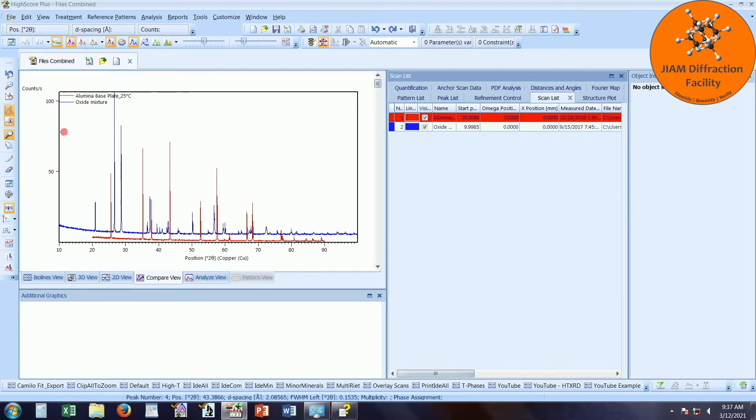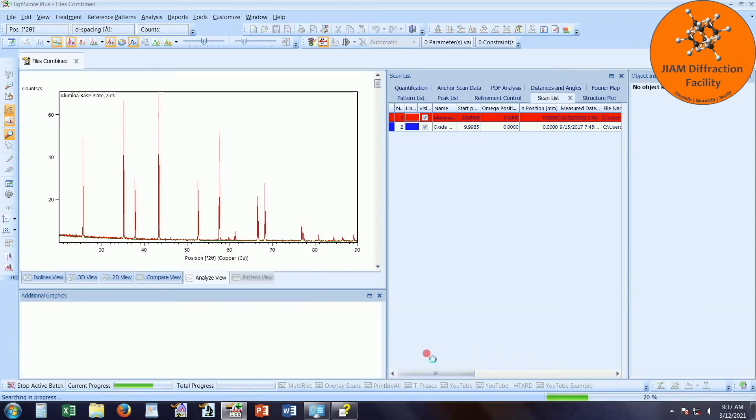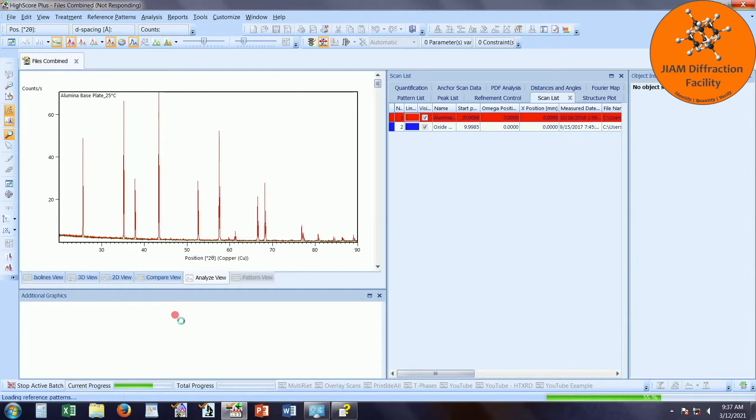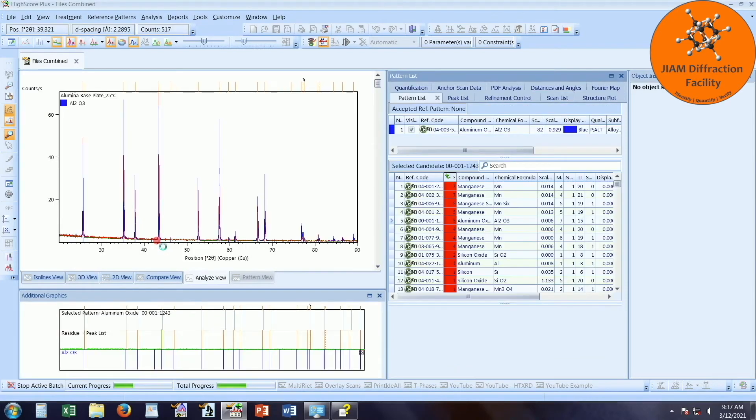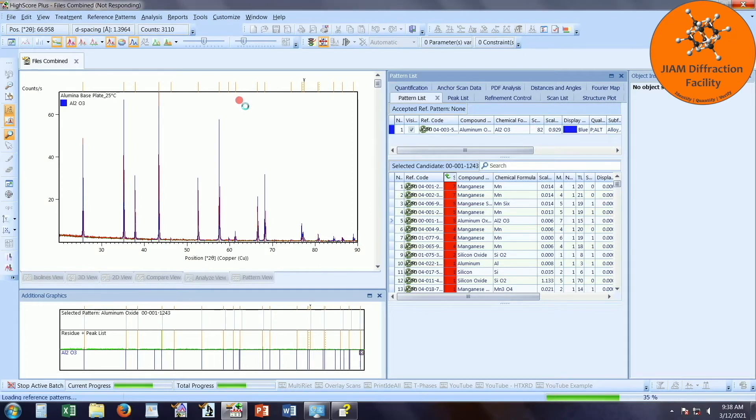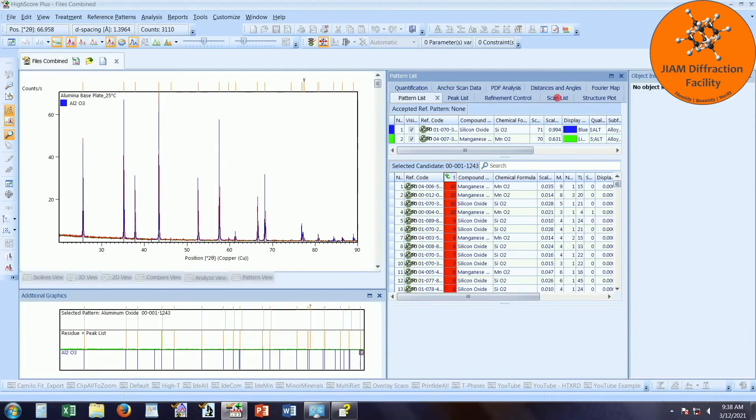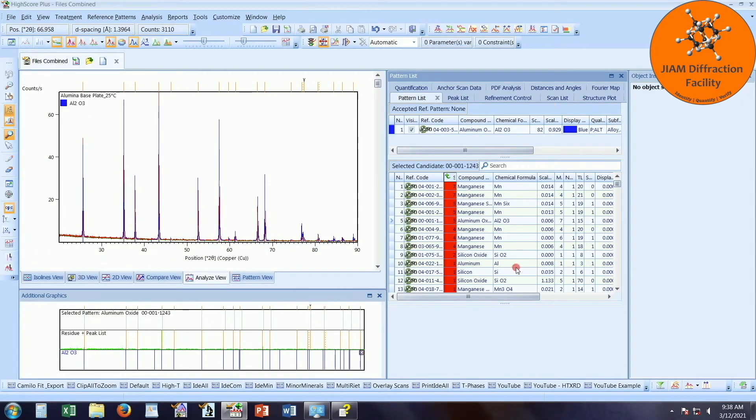So here we see our two scans. They are obviously very different. I will start by clicking on analyze view and then just clicking this YouTube example button that I have created. Here we see the current progress. We are loading reference patterns for the first data file. The background has already been determined, the peak search has completed, and we have the phase identified for the first data file. Now it is doing the second data file, and now it's done.